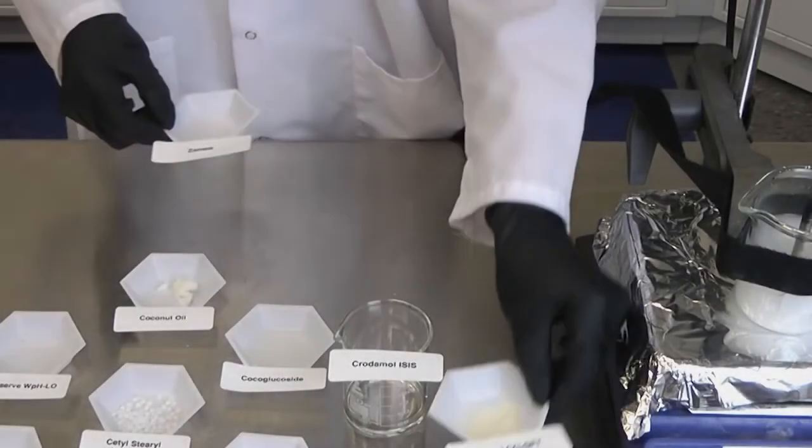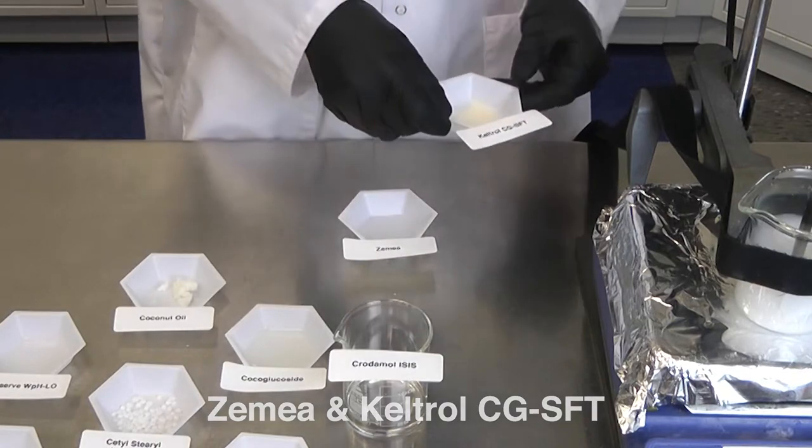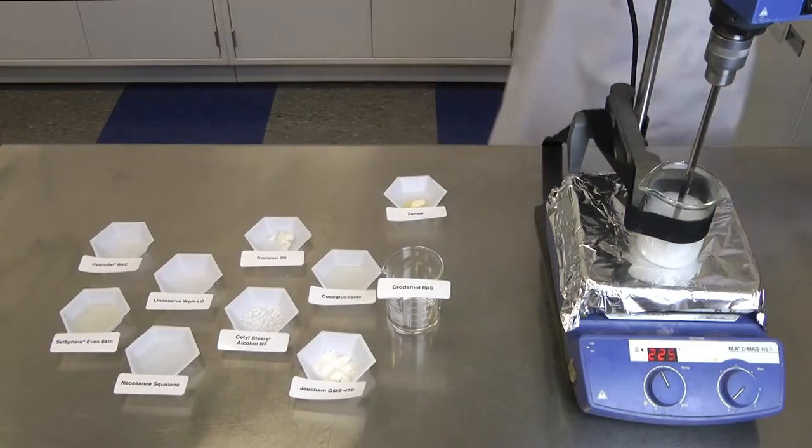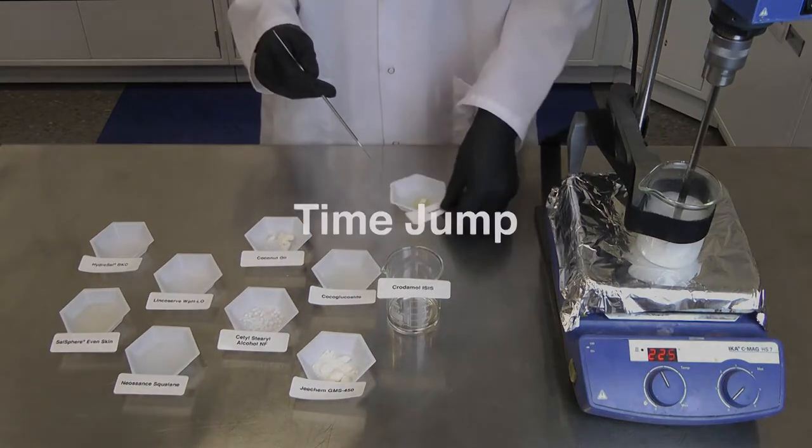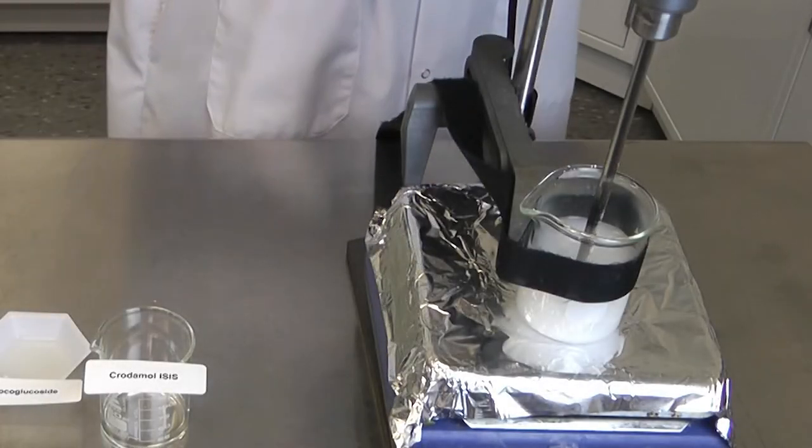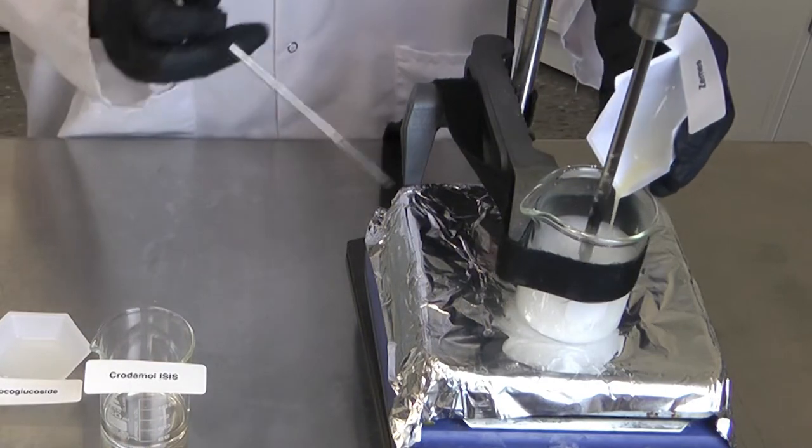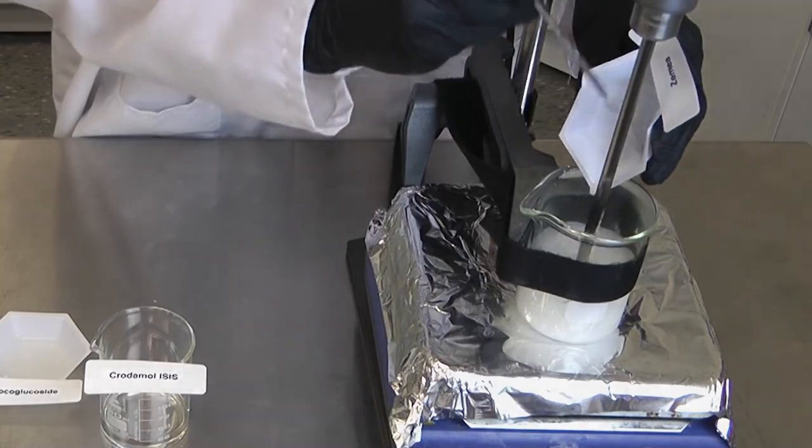Our next step is to make a pre-mix of xanthan gum and propane diol. The xanthan gum will eventually thicken the water phase, and we are pre-mixing it with the propane diol to aid in its solubility into the water. Now that the xanthan gum is well dispersed in the Zemea, we will add it to our formulation. This should thicken the formulation a small amount, so increasing the propeller speed may be necessary.